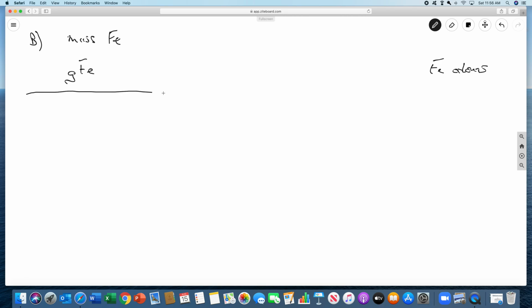Now for part B, this is tricky. What you're going to do first, step 1, and I think we did this in the video, though I don't remember if we did, because I'm writing this before I looked at the video, or if we're going to give you the numbers. But either way, the first thing you're going to do is determine the density.